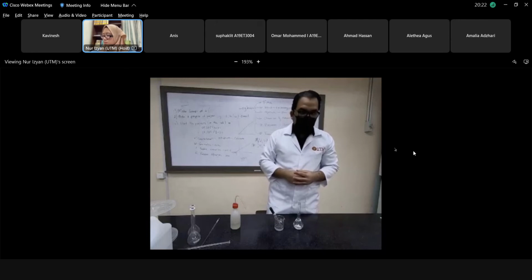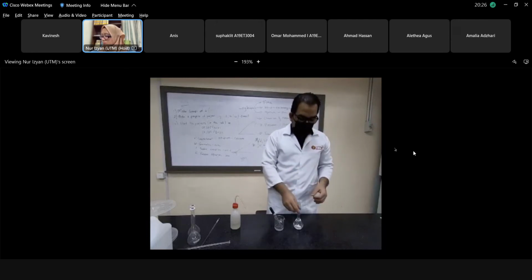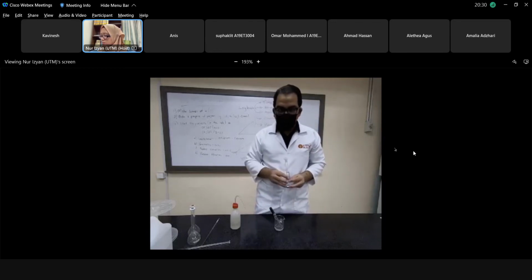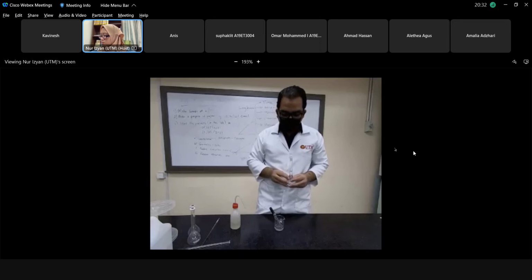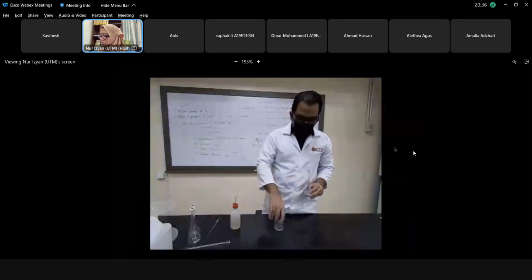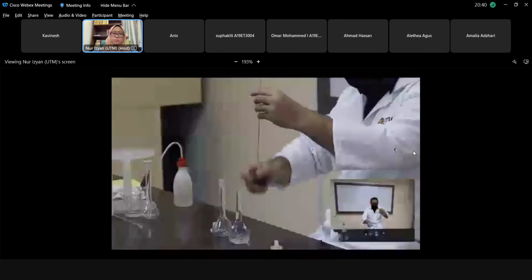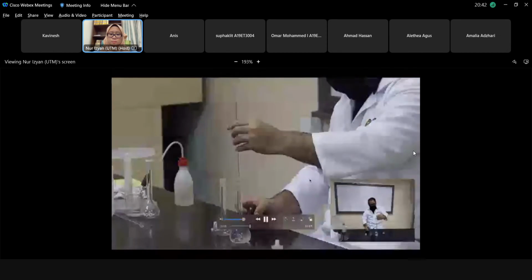Since we have done preparing the stock solution of 1000 ppm zinc, the next step is to prepare the working solution. We need to prepare 10 ppm of working solution from the stock solution that we have prepared earlier. Now I'm going to show you how that can be done. So I am going to pipette.